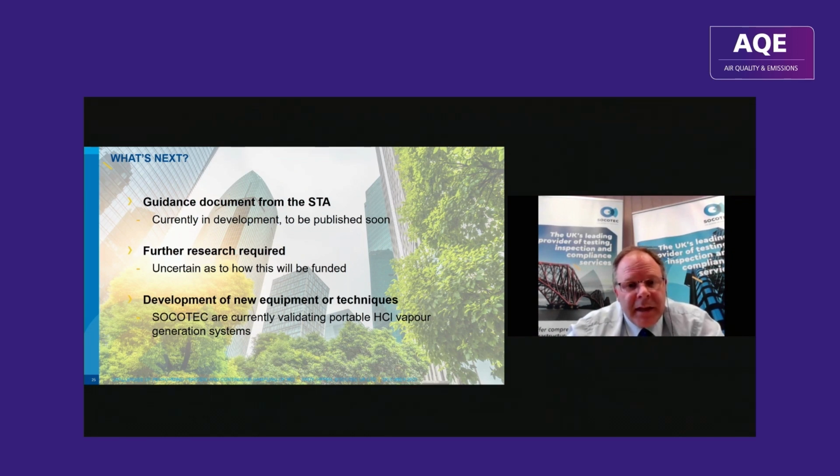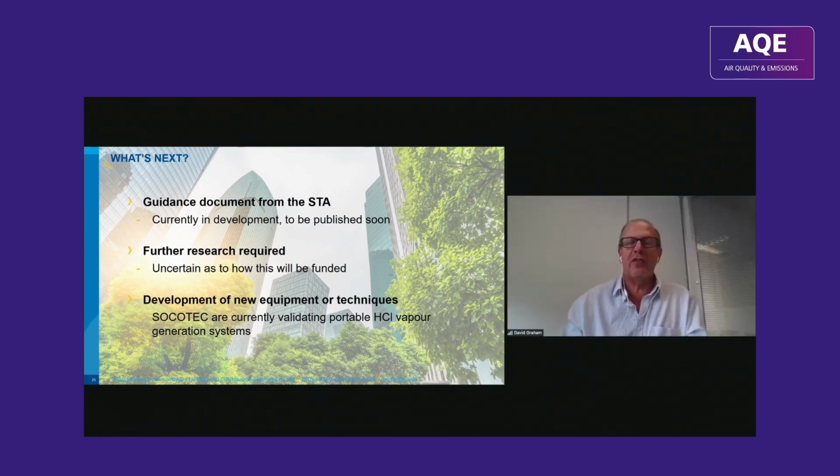And the final thing is development of new equipment or techniques, so anything that comes along that may speed things along. And I'm quite glad to say at the moment that Socotec are currently validating a completely portable HCl vapor generation system. So we're hoping to be able to move away from dry gas validations and start doing our validations in line with this new European standard, where we can produce HCl vapors on site. Yes, watch this space. Thanks very much indeed, Andy.